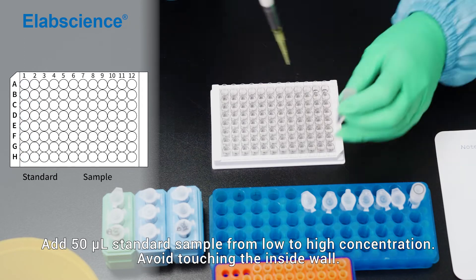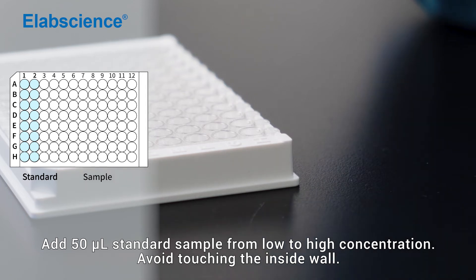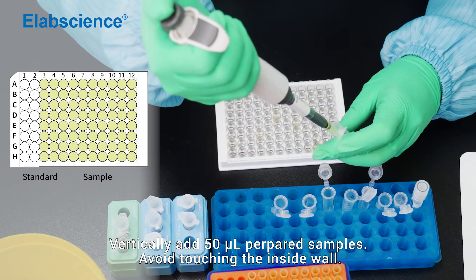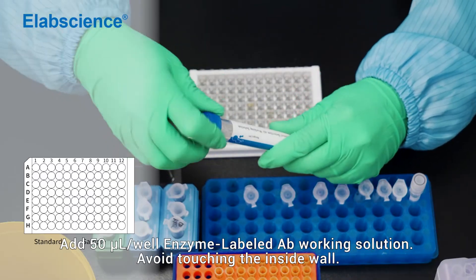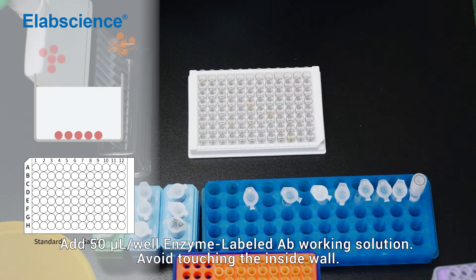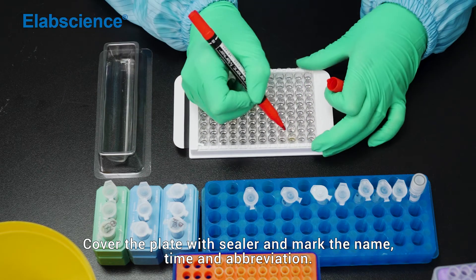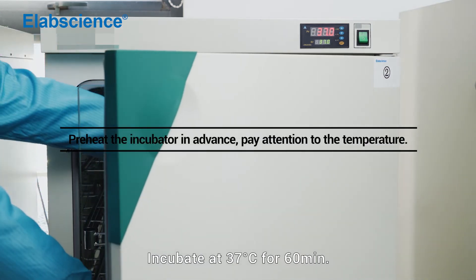Add 50 µL of standard sample from low to high concentration, avoiding touching the inside wall. Cover the plate with sealer and mark the name, time, and abbreviation. Incubate at 37 degrees for 60 minutes.